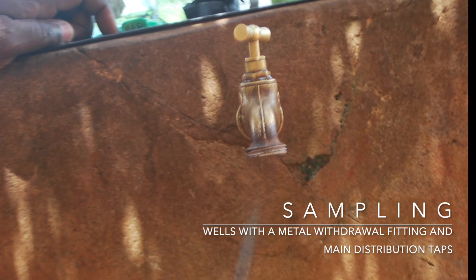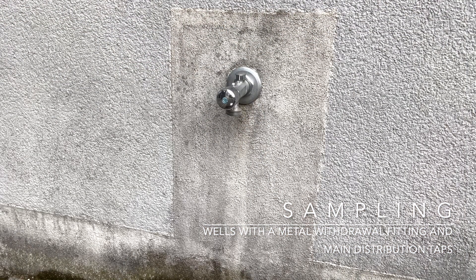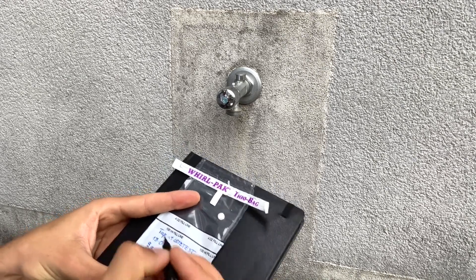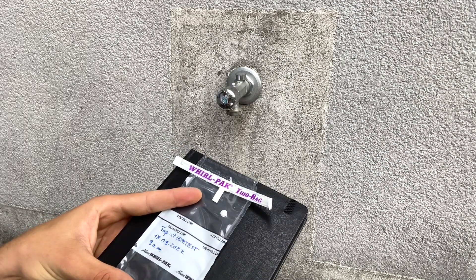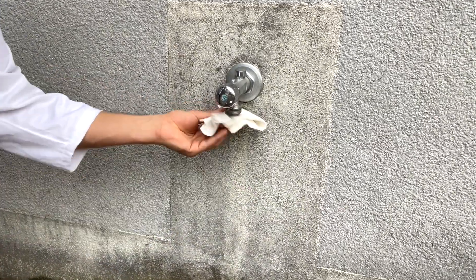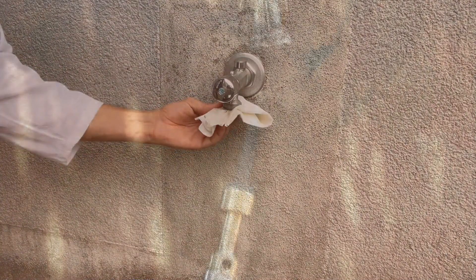When taking water samples from wells with a metal withdrawal fitting or from main distribution taps, proceed as follows: Label the sample bag with a waterproof pen and indicate the ID, date, and time of sampling. Then wipe the end piece with alcohol.